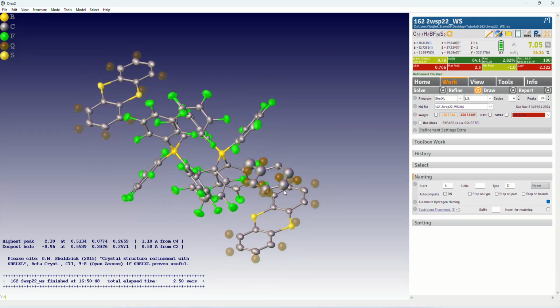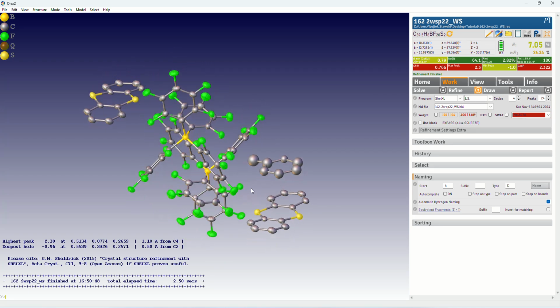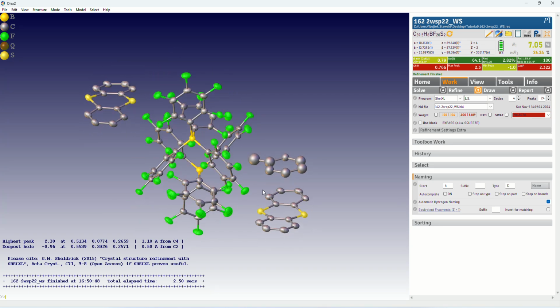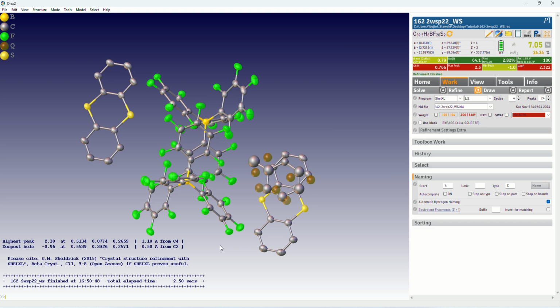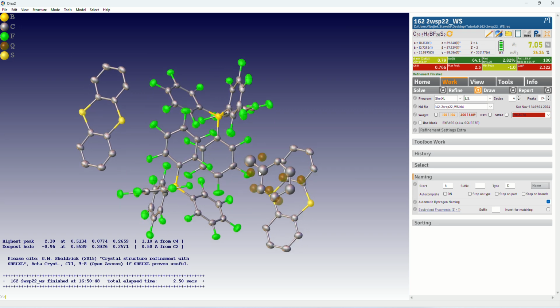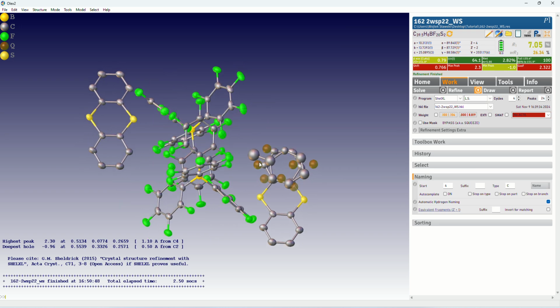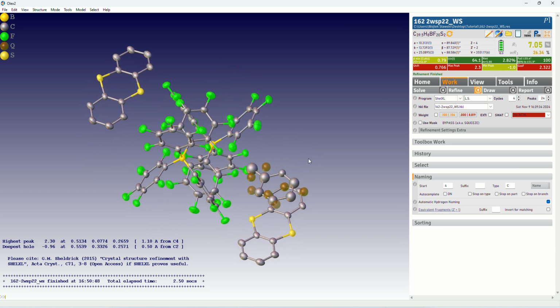So we're going to try to do it in 3 different ways. In this video, I will show you 2 ways of doing that, and later I'll show you another method. So at first, let's actually discuss what we are going to do. We want to split these 7 carbon atoms into 2 disordered components. That one will be part 1, and the second orientation of toluene with the benzene ring here and the methyl group right here will be in part 2, and we will also refine their occupancies.